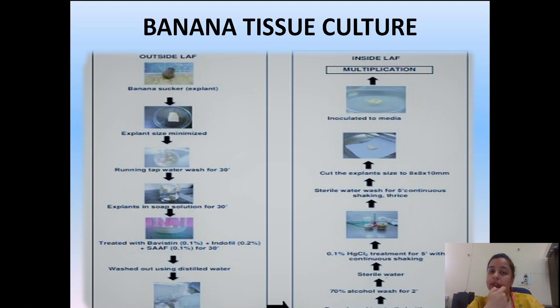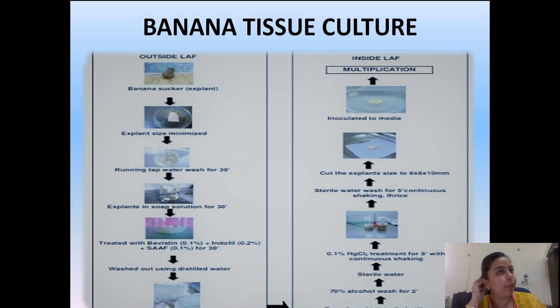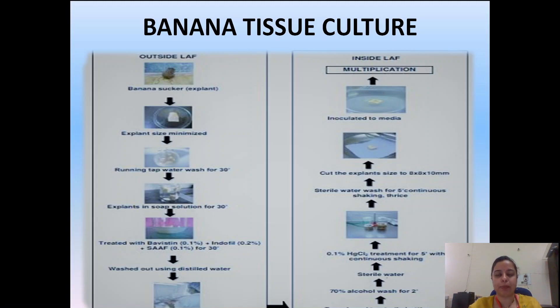The banana sucker is cut and the size is minimized to a very small size. It is then washed in tap water for 30 minutes. The step of surface sterilization of the explant then starts. Surface sterilization consists of three steps: first, washing the explant in simple running tap water for 30 minutes; second, washing in soap solution for 30 minutes.